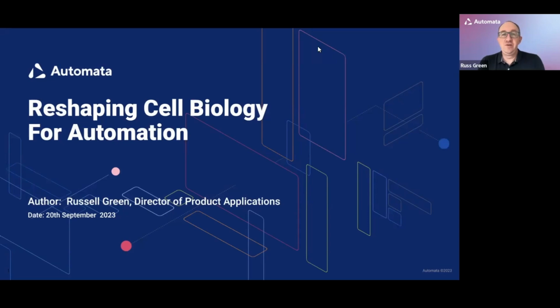So we decided to share some content that we actually recorded just a month ago, which is very relevant to this particular space. It's around how we can modify both our system designs of automation and our experimentation to come up with better solutions for applying automation to things like tissue culture. We had planned to talk exclusively around cell line development applications. I do speak to that later on in this talk, so if you stick with us, we'll talk about how we can apply automation to cell line development and the kind of impact that has, as well as a couple of other applications.